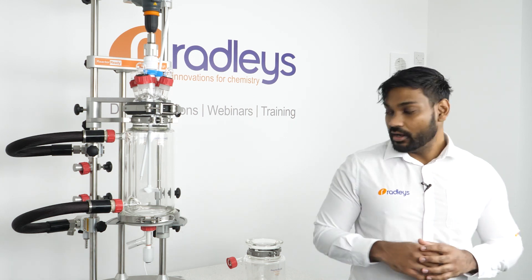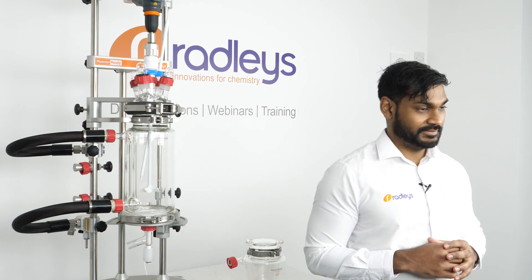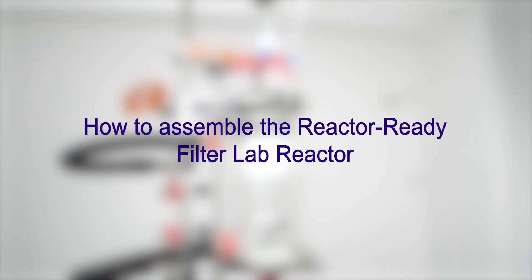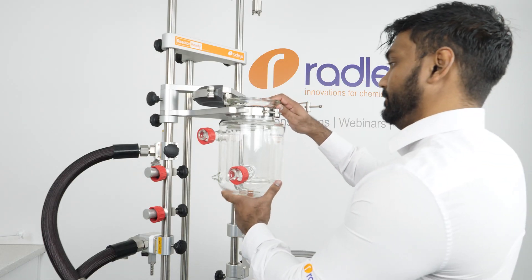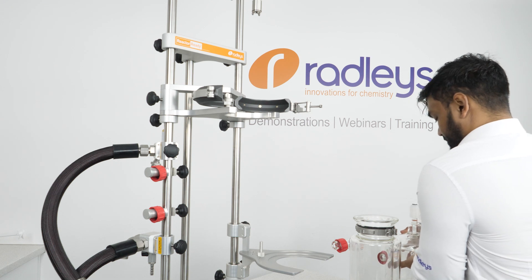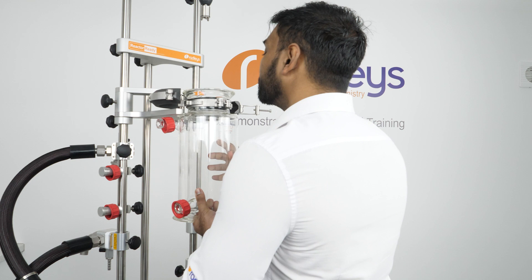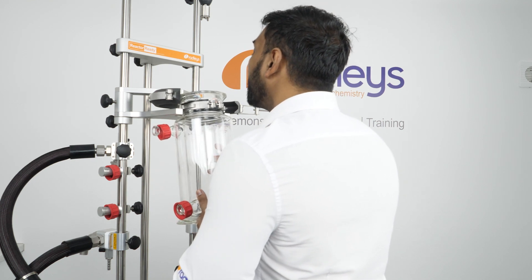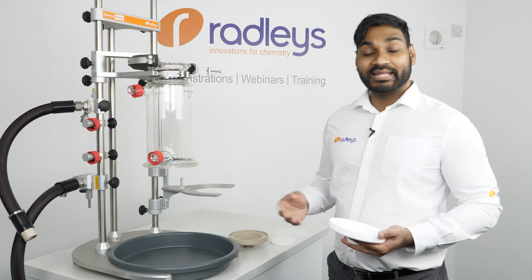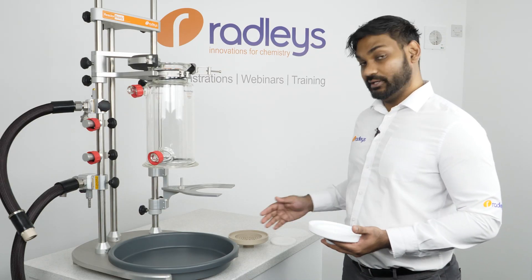Now I'll demonstrate how we assemble the filter vessel and talk through some of its features. Filter vessels have the same neck size as our standard and process Reactor Ready vessels, so they fit into the vessel support in exactly the same way. We can load the vessel into the framework by simply locating the vessel collar into the vessel support.